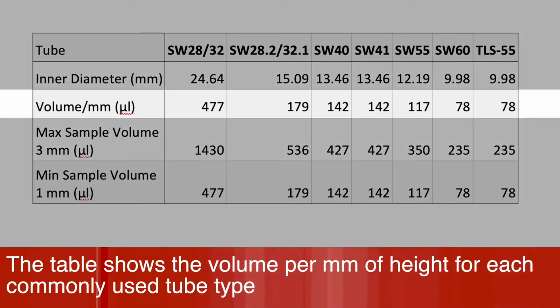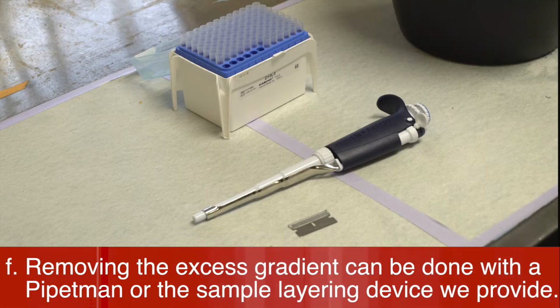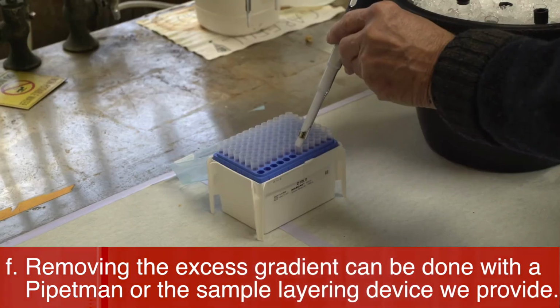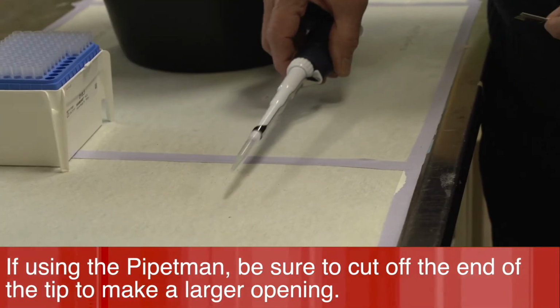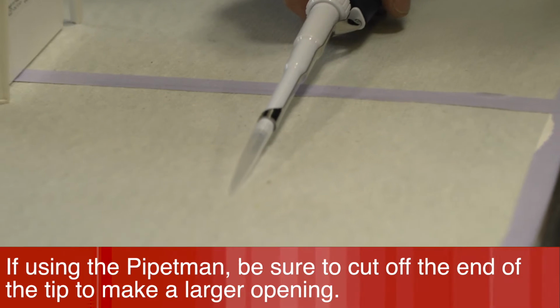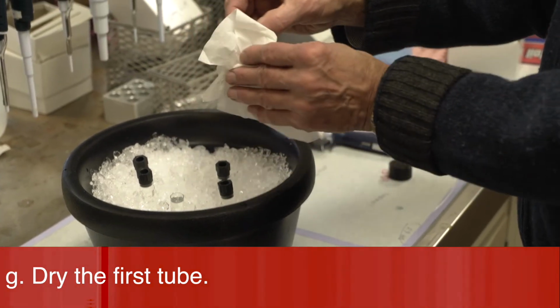The table shows the volume per millimeter of height for each commonly used tube type, and the recommended minimum and maximum sample volumes. Removing the excess gradient can be done with a pipette man or the sample layering device we provide. If using the pipette man, be sure to cut off the end of the tip to make a larger opening. Dry the first tube.